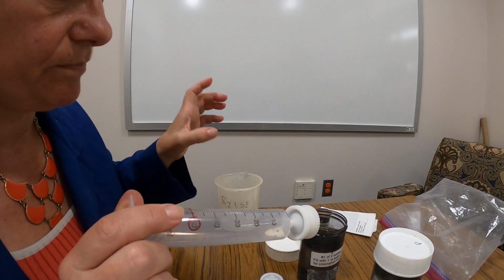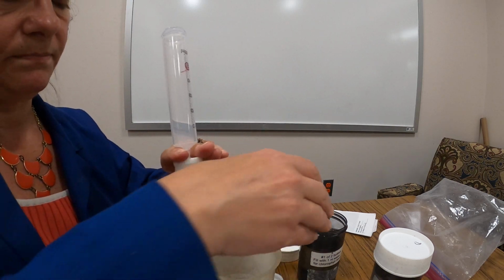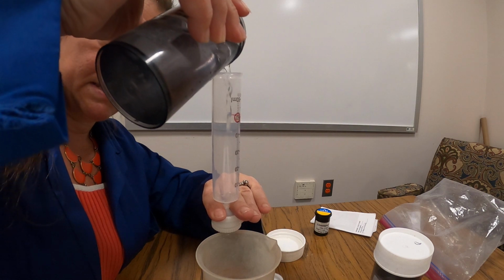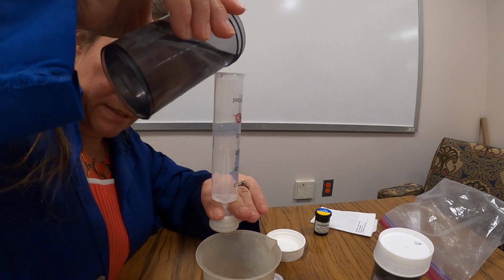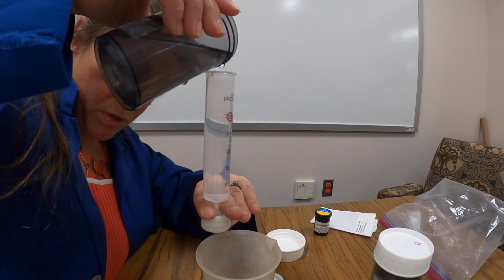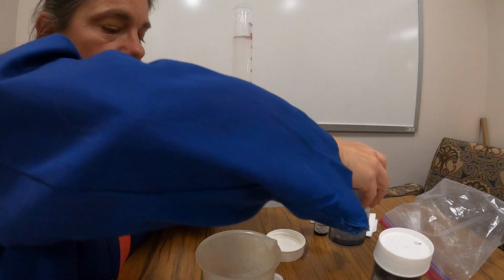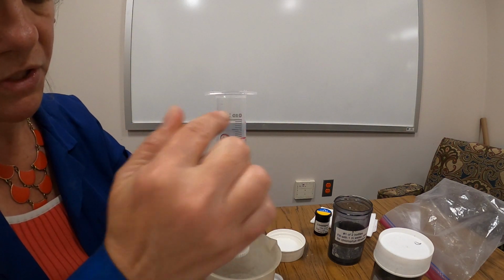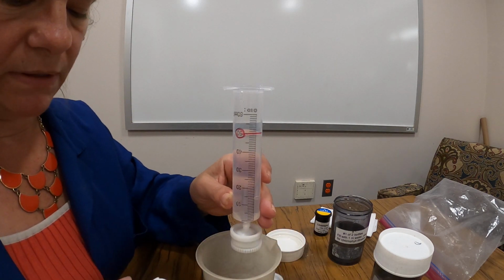And now with my finger on the bottom, I'm going to add 50 mils of my well mixed sample. And I want my finger to be on the bottom so that I get an accurate measurement and water's not going through my filter. So you want to read, basically there'll be like a little curvature. So the bottom of that curve you want right at that 50 mil line.